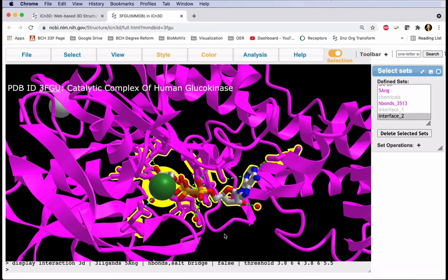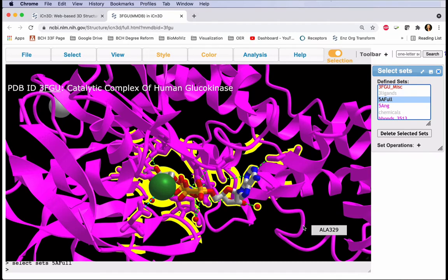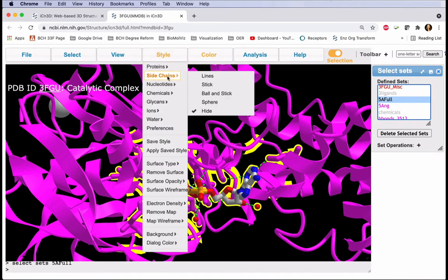To show our entire five angstrom active site as sticks, we'll select that in our menu, five angstrom full. We'll select that in our Select Sets pop-up menu. Now in the Style menu, Side Chains, Stick.